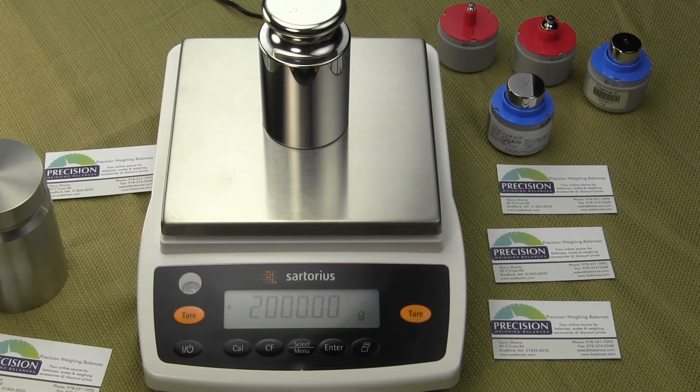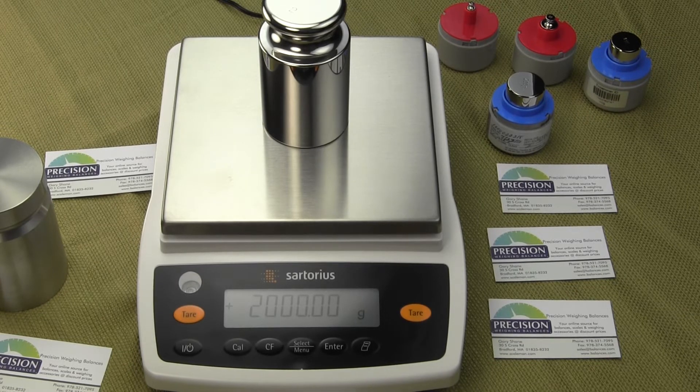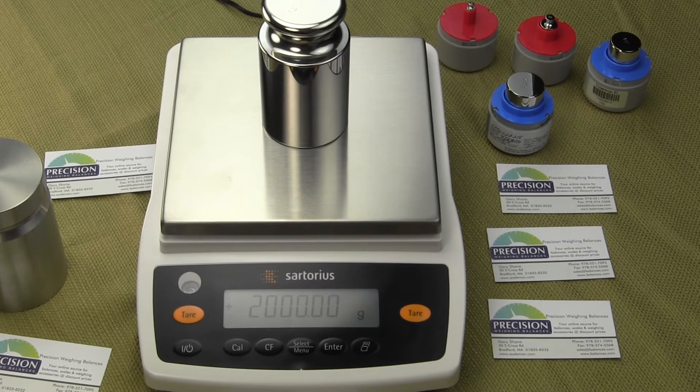Welcome to Precision Weigh Balances. In this video we're going to demonstrate how to configure the balance so that it can weigh in multiple weigh modes and also change the unit weight. This is a Sartorius Entris series. When the Entris is delivered it's set up to weigh in grams only and it's in weigh-only mode, not in the unit mode. The first thing we need to do is go into the configuration, which is pretty intuitive.